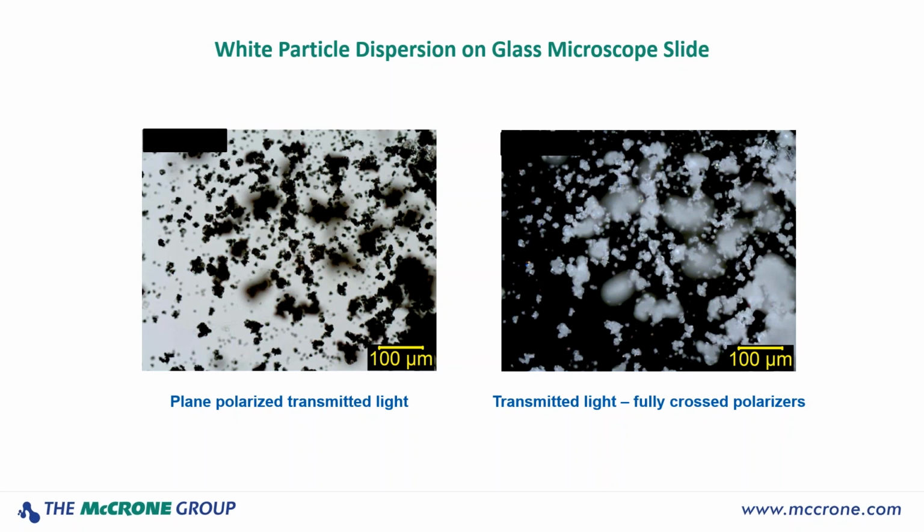And you'll note that if these particles were dispersed in a much finer monolayer type dispersion, the contrast of black against the white background would be really good to do particle sizing measurements with offline particle sizing type software. So you can take a bunch of images like that and then collect the images into the software for the particle sizing.